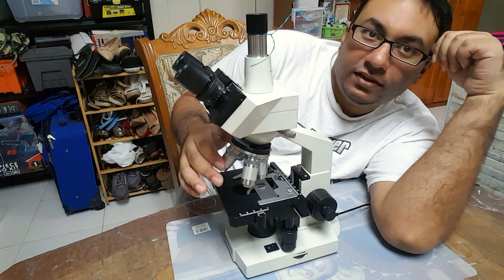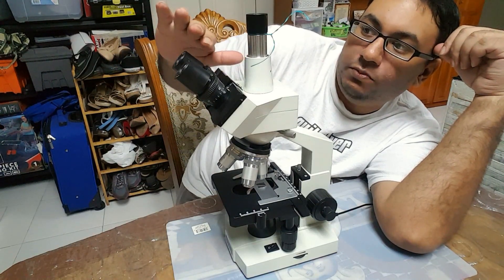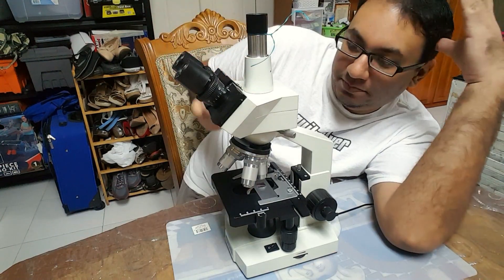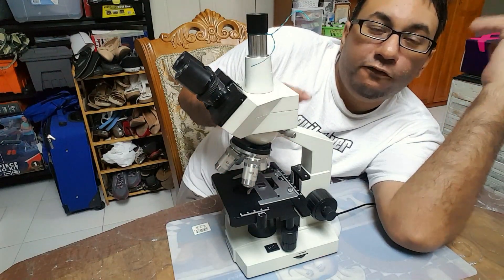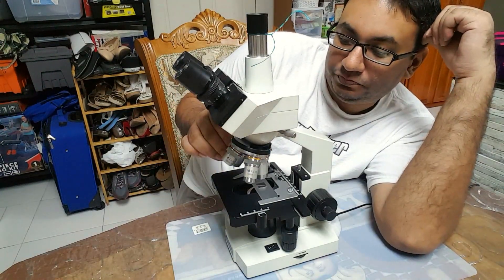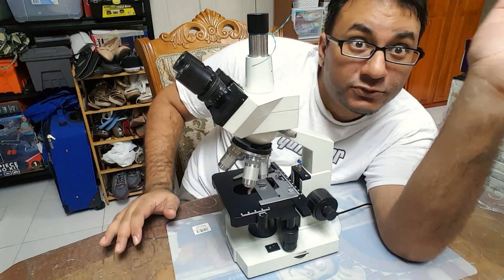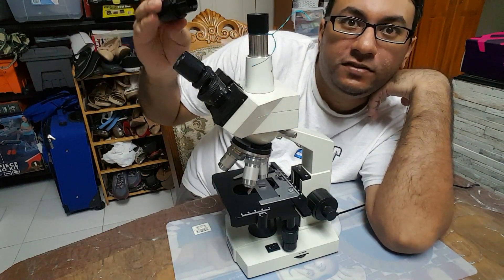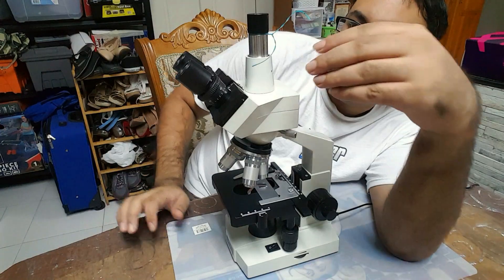What happens is it uses the magnification of these objective lenses plus the eyepieces, which also have magnification. This particular set came with 10x eyepieces. So you multiply the eyepiece by the objective: 4x times 10 gives you 40x, 10 times 10 gives 100x, 40 times 10 gives 400x, and 100 times 10 gives 1000x. To reach 2500x, the eyepieces are interchangeable — you can replace the 10x eyepieces with 25x eyepieces, which they also provide.